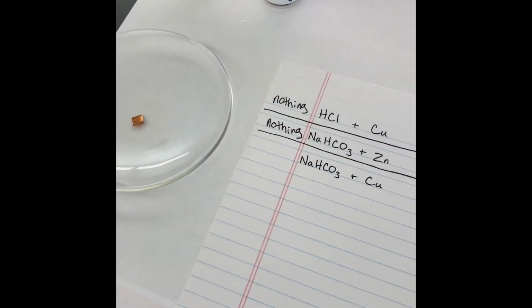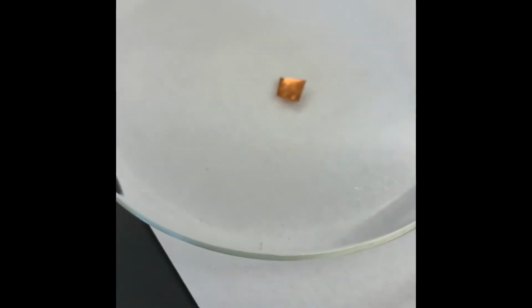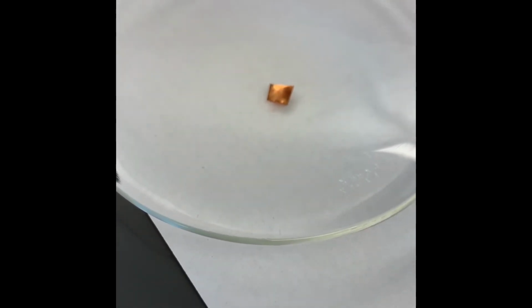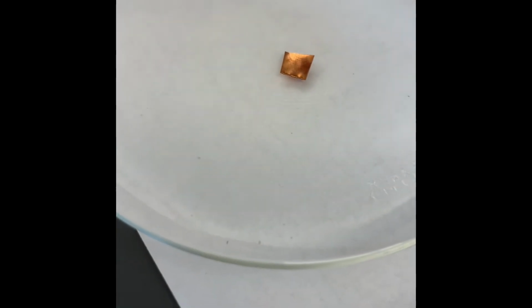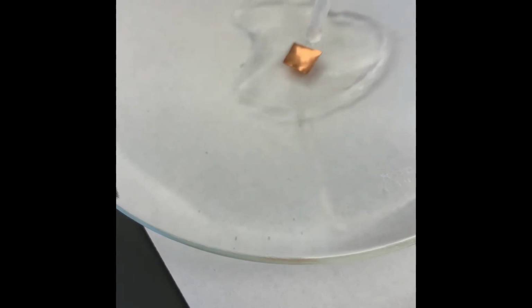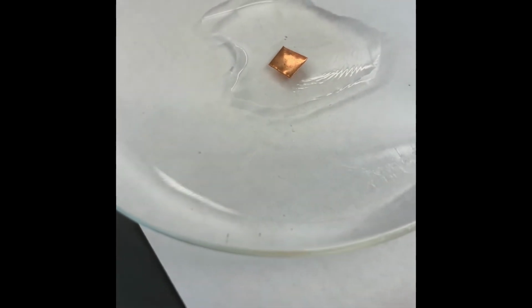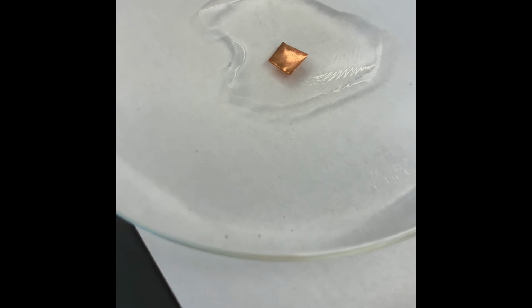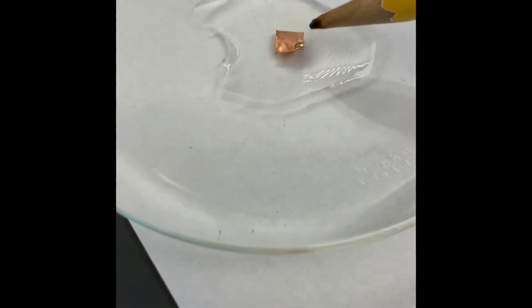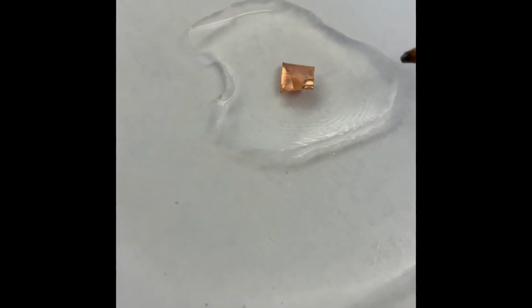All right, last one, sodium bicarbonate and copper foil. Nothing happening on either side of that piece of copper foil.